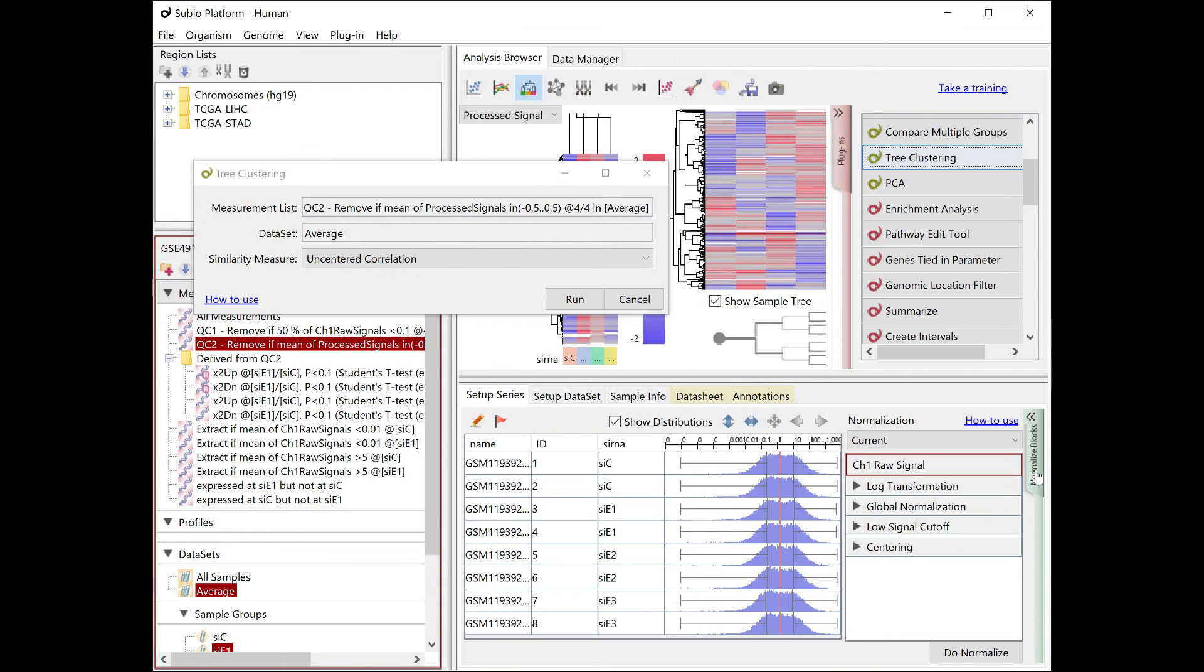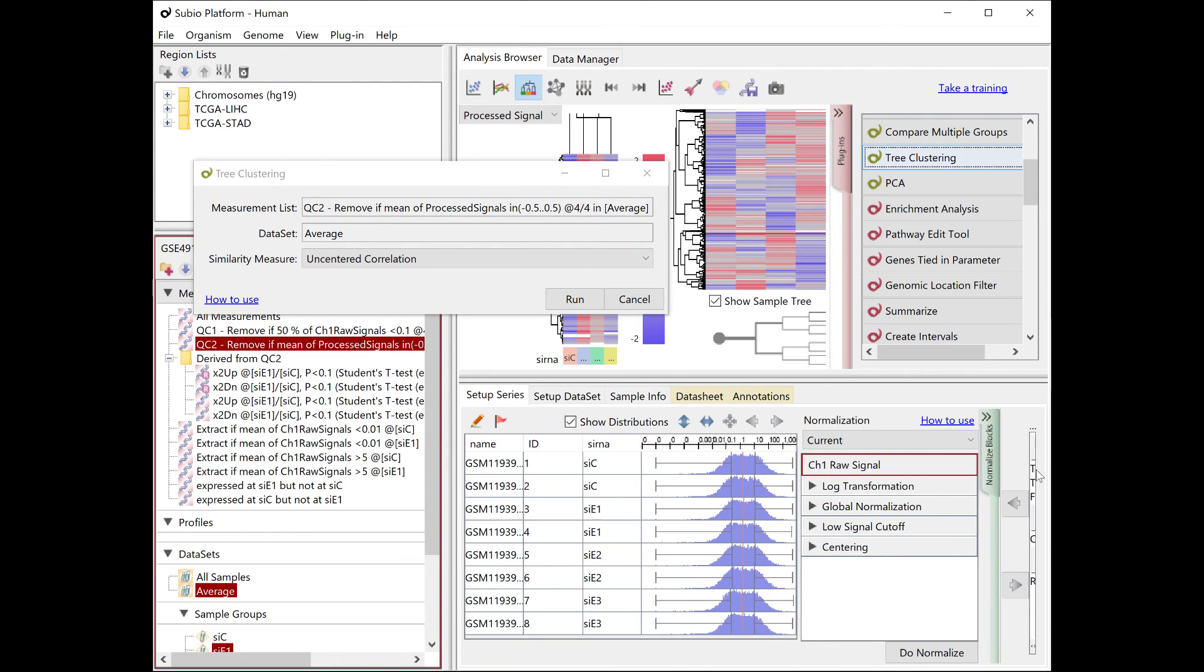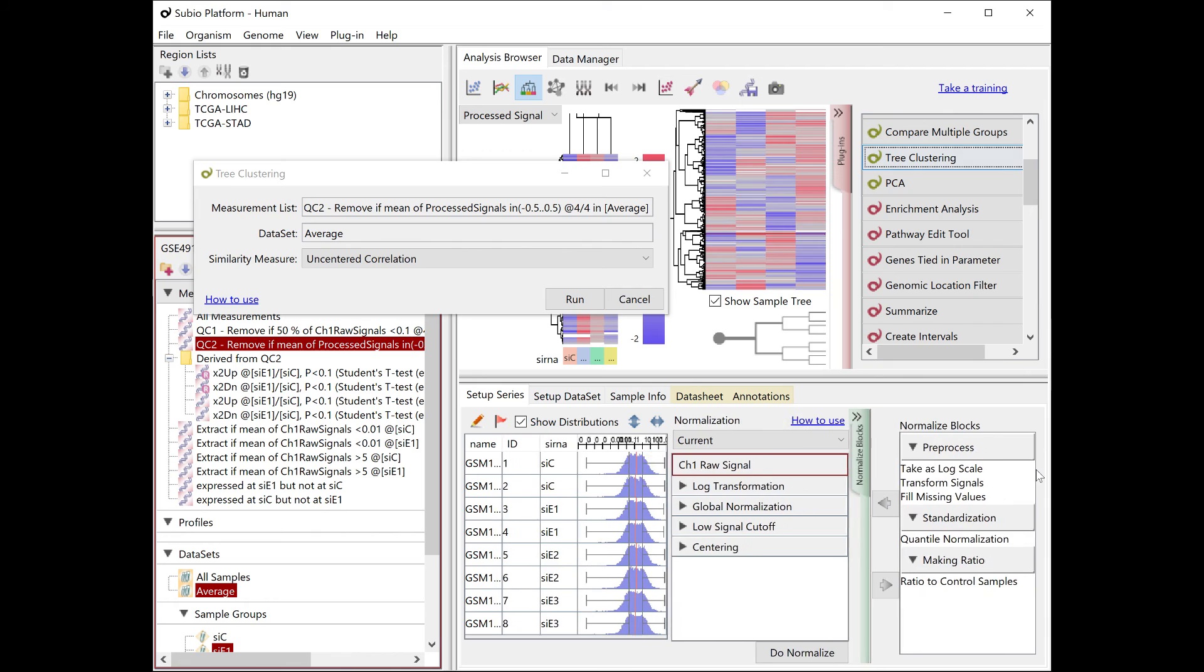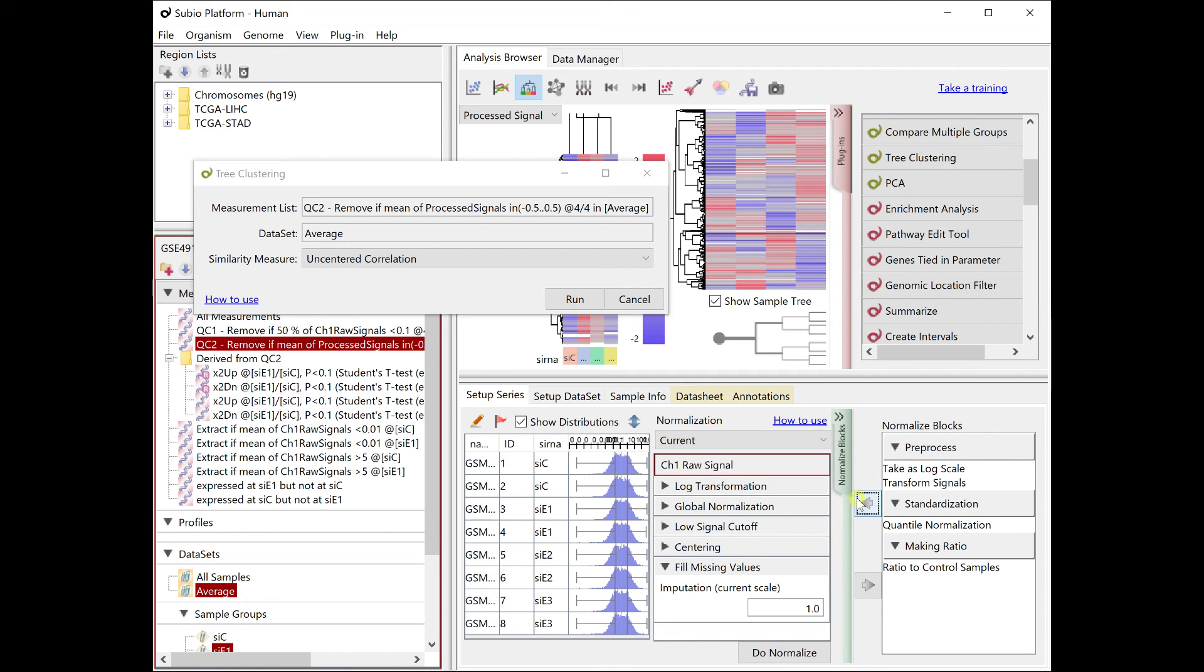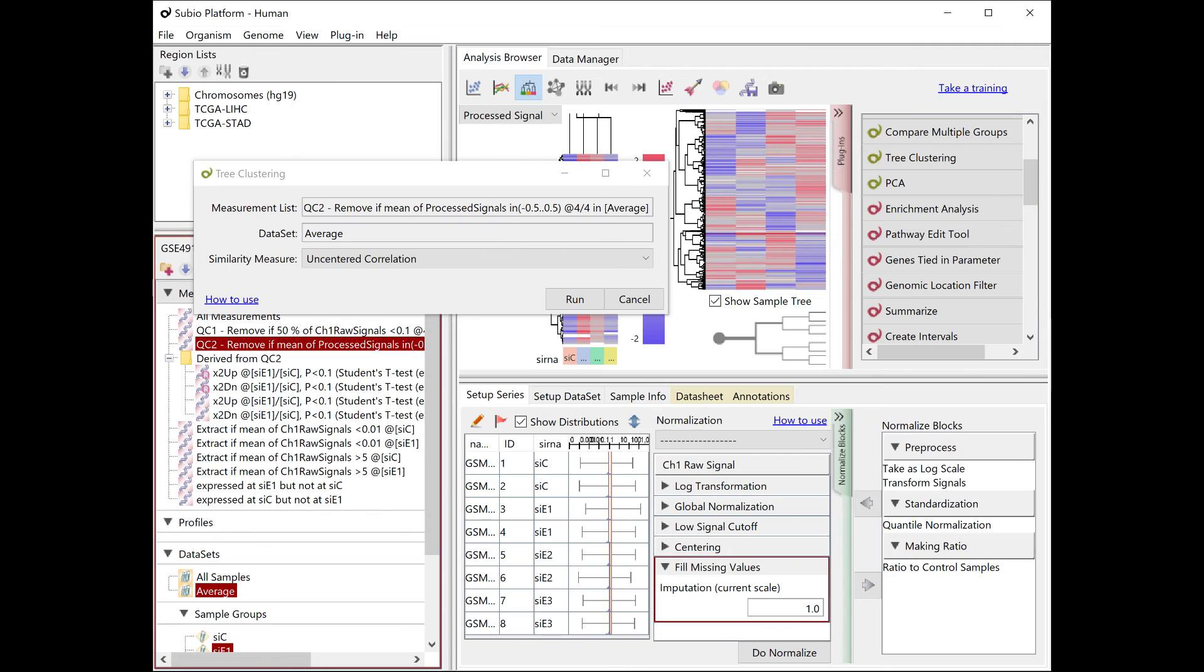Now, go back to the Setup Series tab, go to the Normalization setting. Add a block of fill missing values at the end. The value to be filled should be between 0 and minus 1.